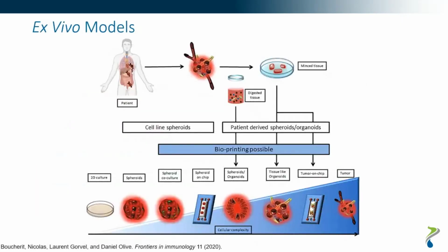Talking about 3D cell-based models, from spheroids to organoids and organ-on-a-chip technologies, 3D cell models lie on a spectrum of complexity and physiological relevance. And with such evolution in these models and research, and as 3D cell cultures rise in popularity, they bring unique challenges. 3D cell culture methods still require solid expertise in handling and optimization to build good models and assays.